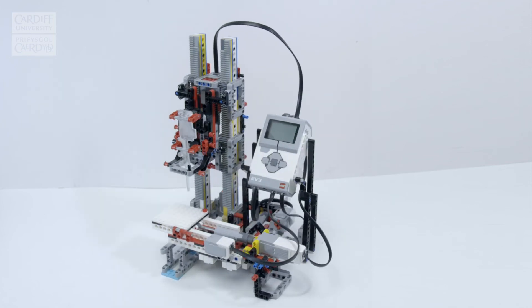Because Lego is readily and widely available, the parts are all standardised. We could share a parts list so that other laboratories across the world could build an equivalent printer to the one we have developed. In fact, we've been doing that internally — new students have come in and built a new printer to replicate our existing ones in less than a day. That gives us multiple printers that we can start further refining, further developing, and doing further experimentation with.